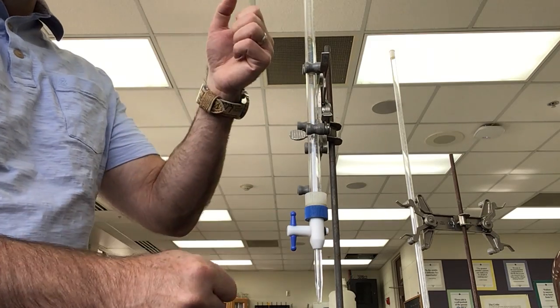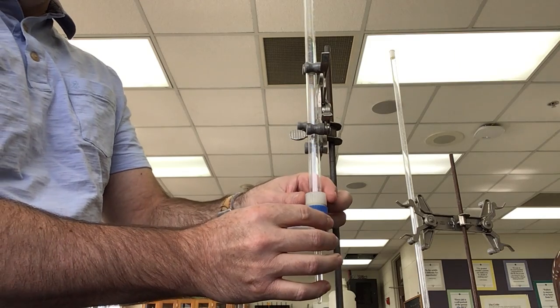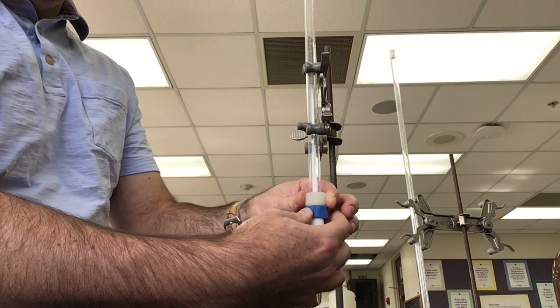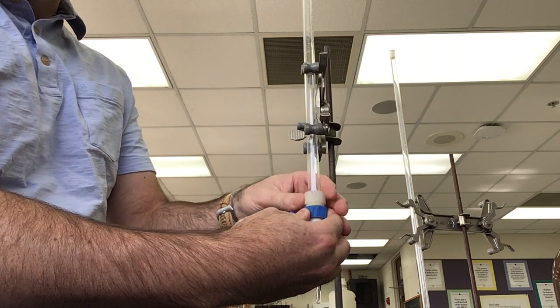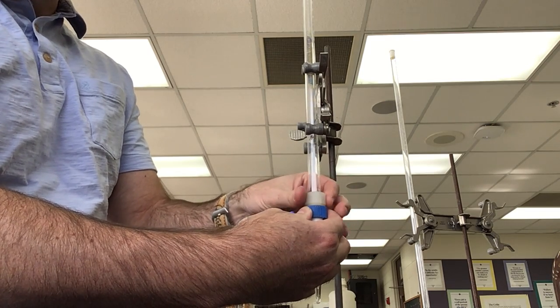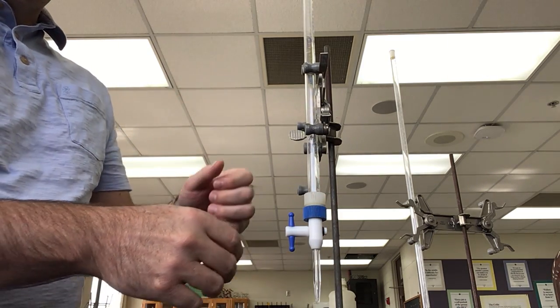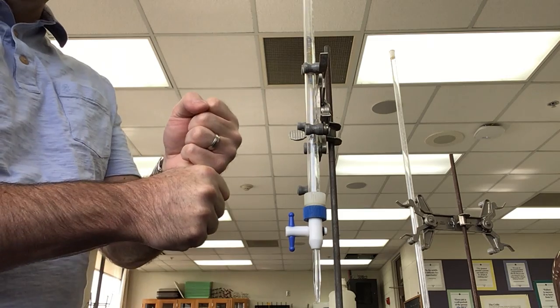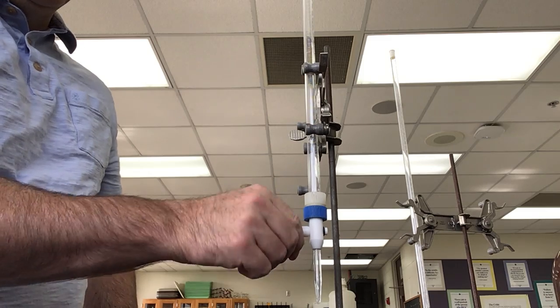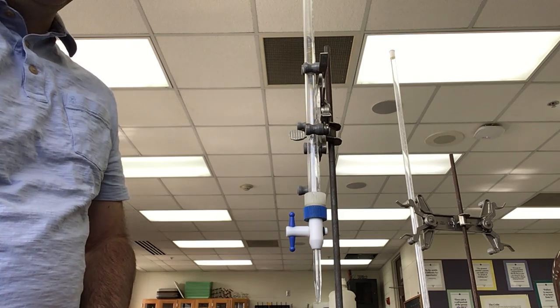But they basically go together by a friction fit. This particular one has two different threads here where these actually turn and they come together. So I'll just kind of really quickly unscrew it here just so you can see that. But these come together, and then that really ensures that those two pieces stay together. If you have a Buret where it's just a friction fit just like that, sometimes over time when we're using the Buret, the tip gets a little bit loose and you can develop a leak there, so just be aware of that.